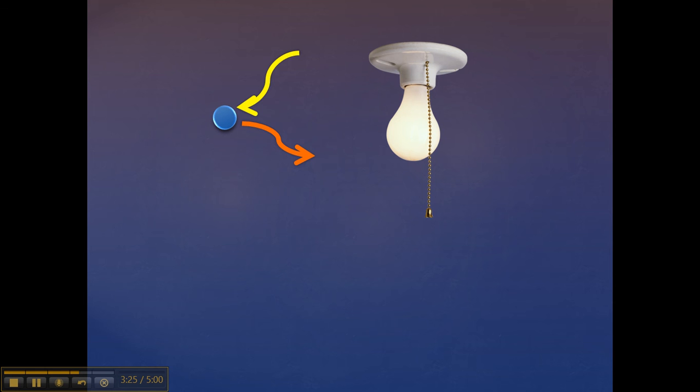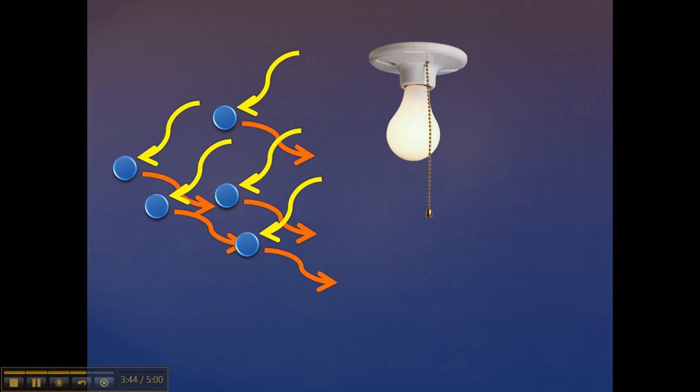This is similar to the phenomenon of turning on light bulbs in a dark room. If you do not turn on any light bulbs, then you will not be able to see anything. If you turn on one light bulb, then light will fill the room and it will be easier to see. If you turn on a second light bulb, the room is filled with even more light and is brighter than when using only one light. The same thing happens in a water sample in that the more atoms of the specific element in the water, the brighter the light will be that is emitted.